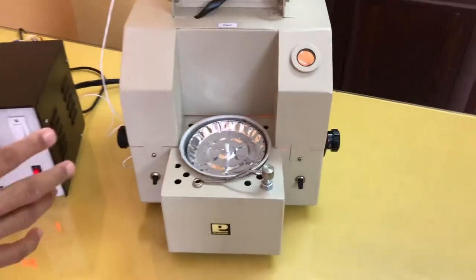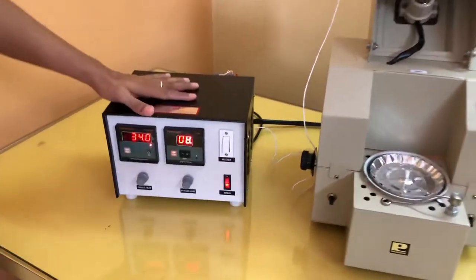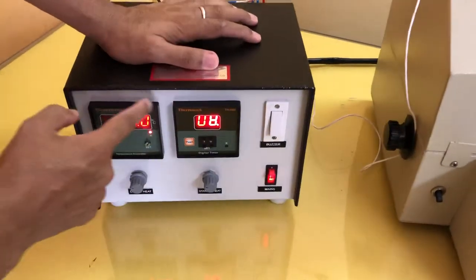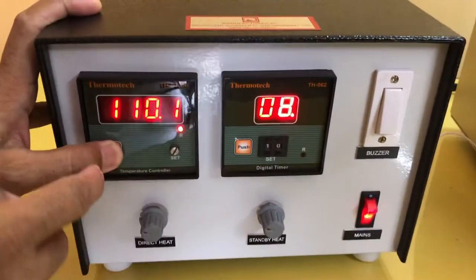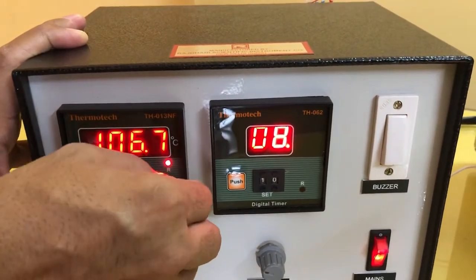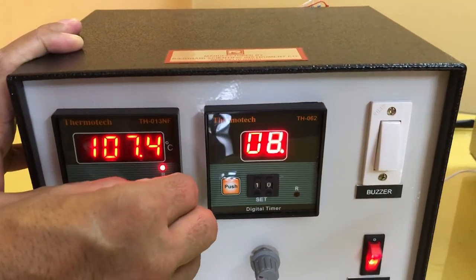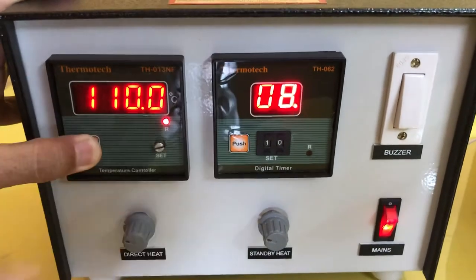Now I will start about the working of the instrument, beginning with the control unit. In the control unit, this is a temperature controller. You keep this push button pressed and by rotating it, you can set any desired temperature. Generally we keep 110. So here again I am setting 110 degrees temperature.